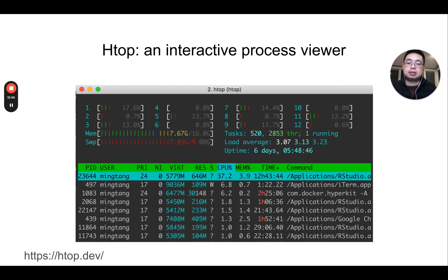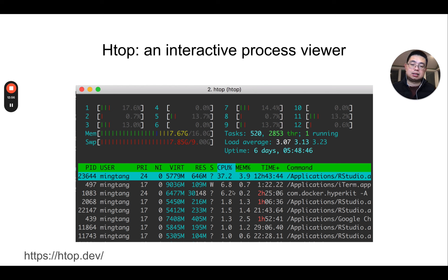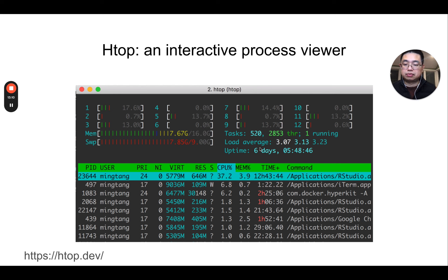htop is an interactive process viewer. The native version is called top. If you use htop, it shows all the processes running on your computer and tells you how much memory you're using and how much memory you have in total. It's been pretty useful.